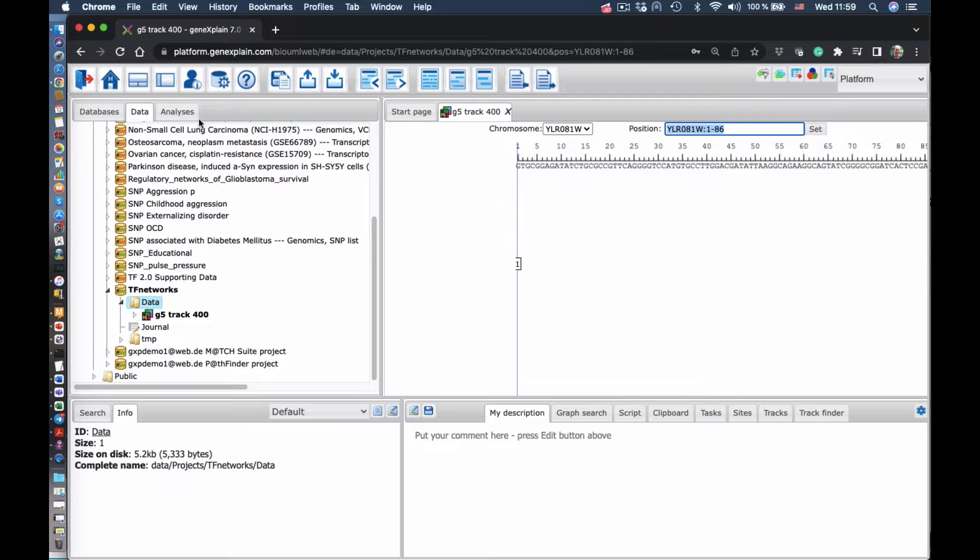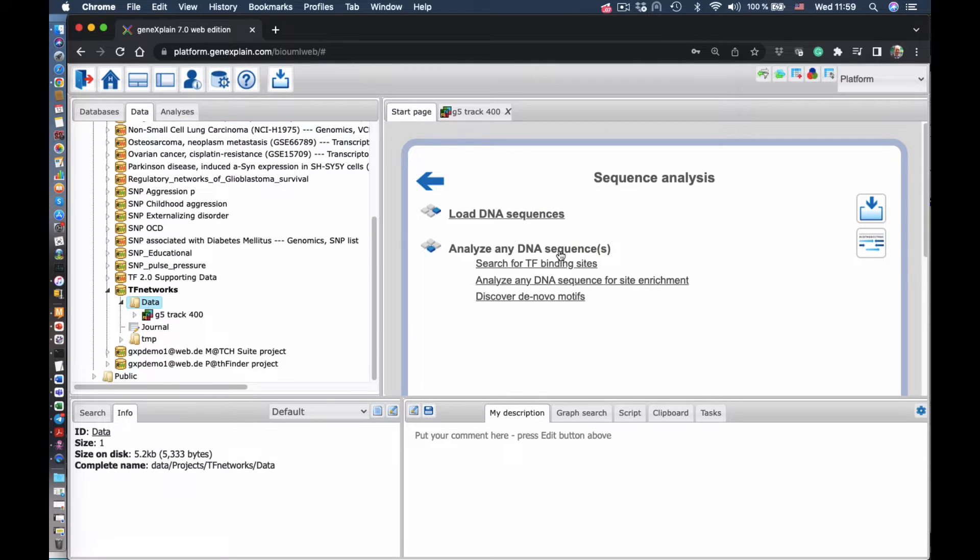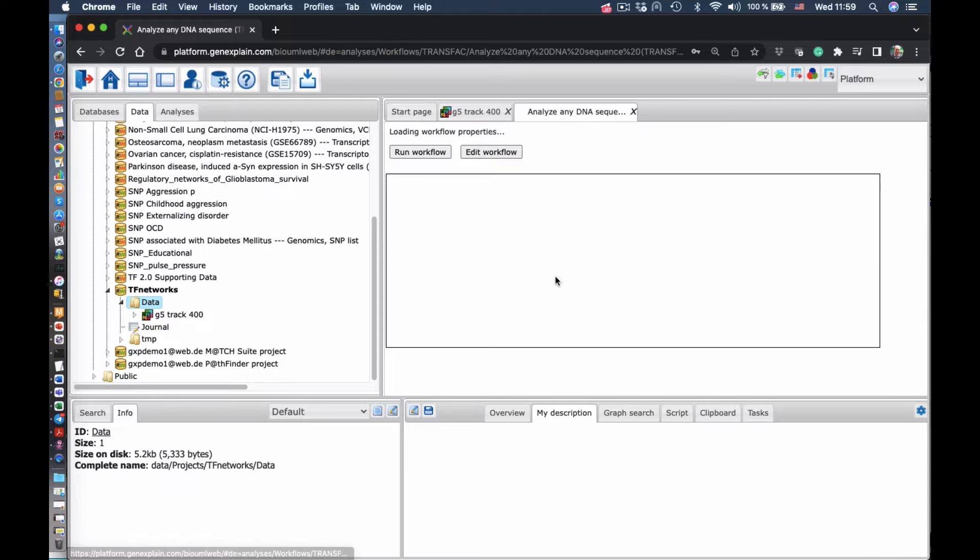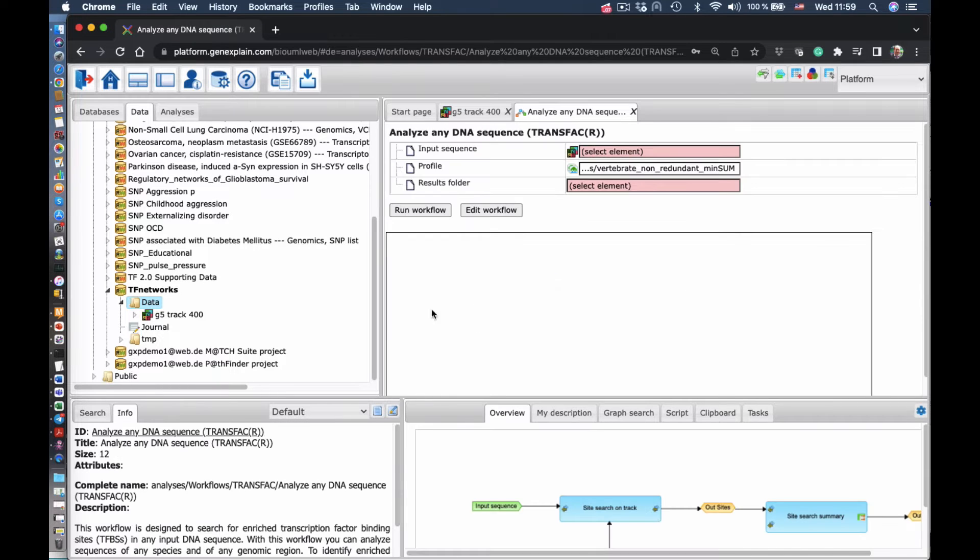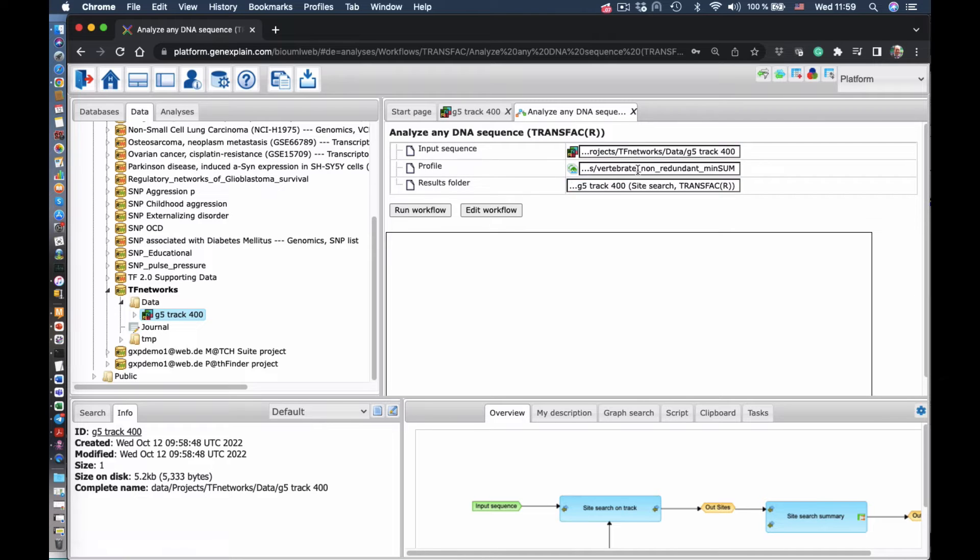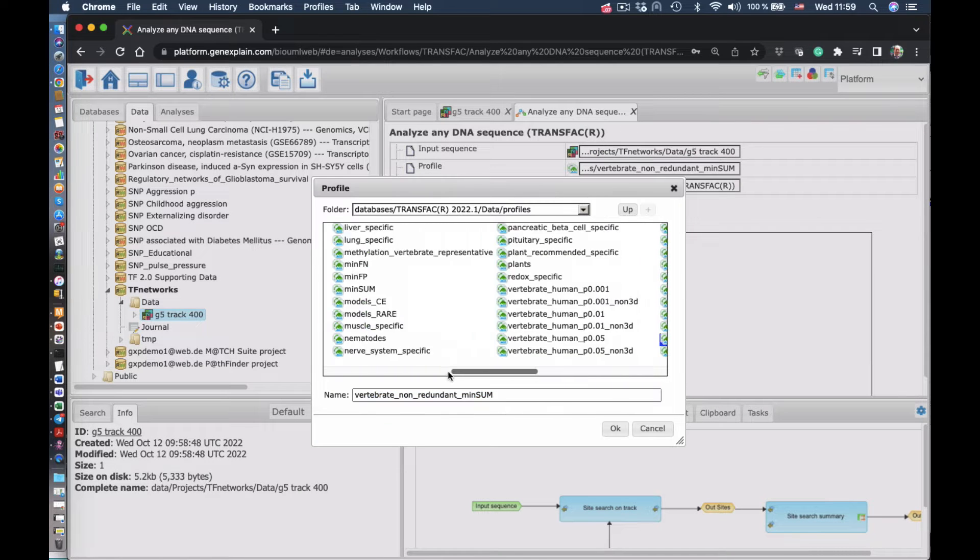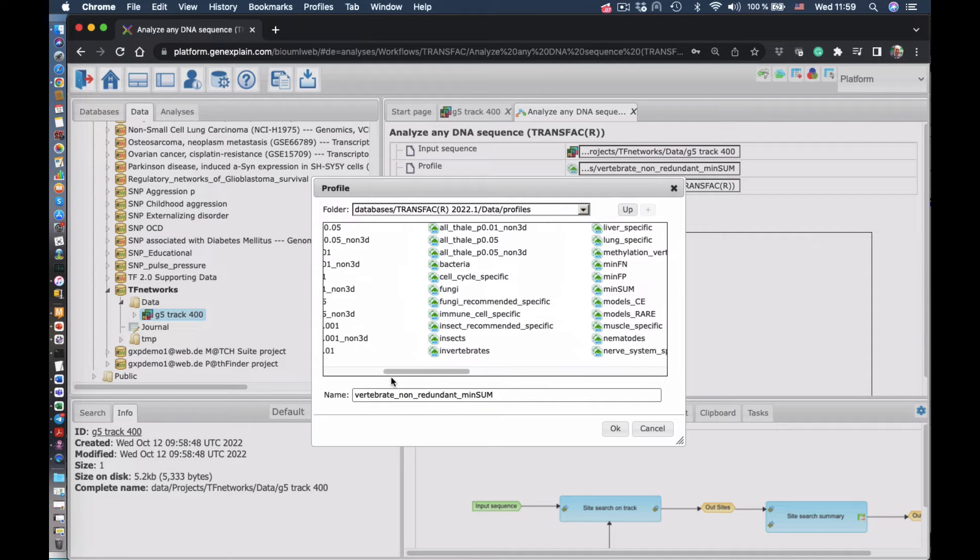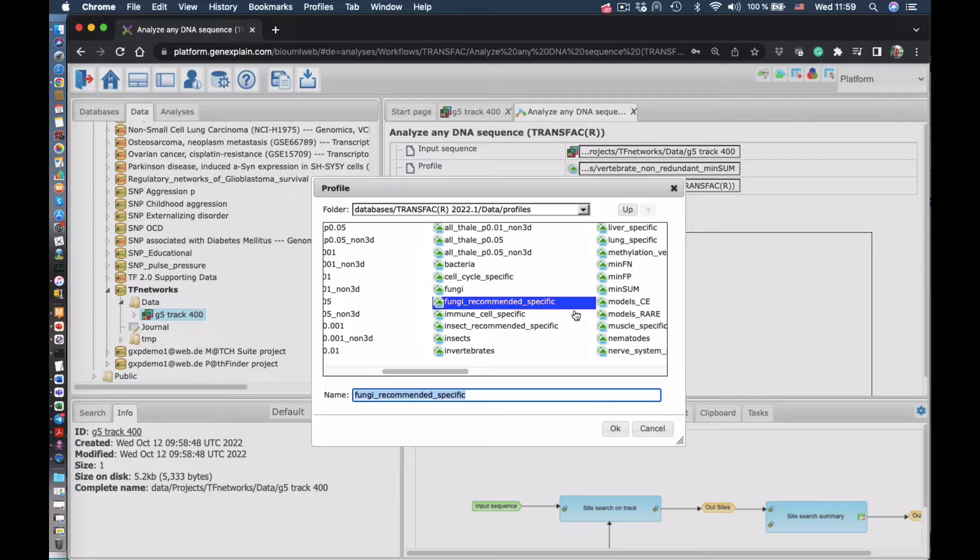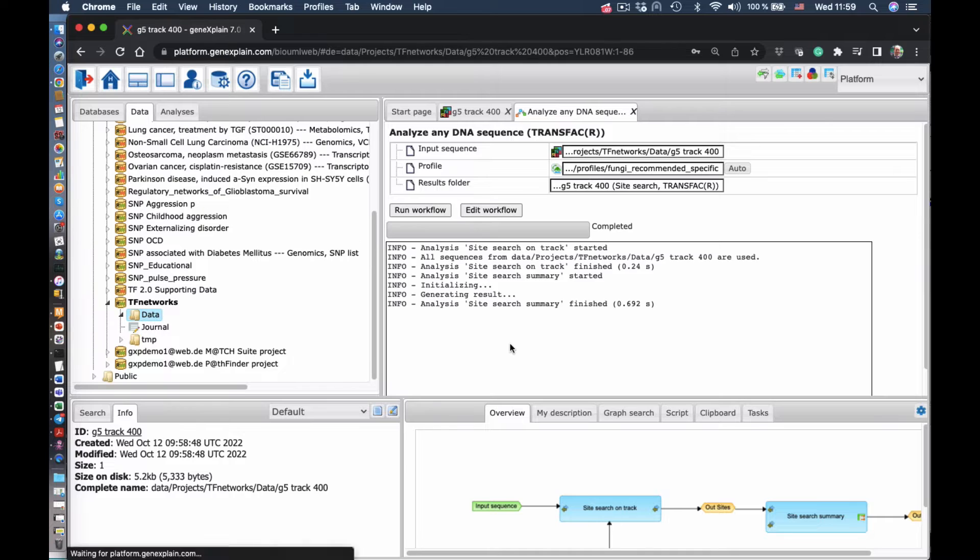Now we return back to the start page and go to the site analysis. Search for TF binding sites. Here the workflow is ready. We put here the file, the FASTA file. And now we select the profile, fungi specific profile, and run the workflow.